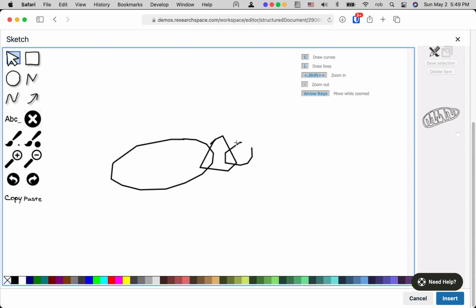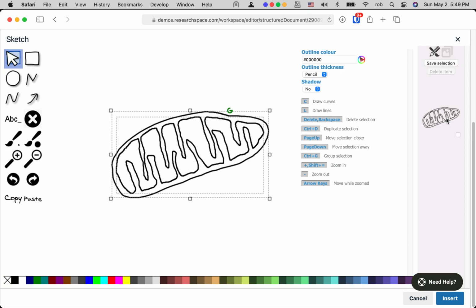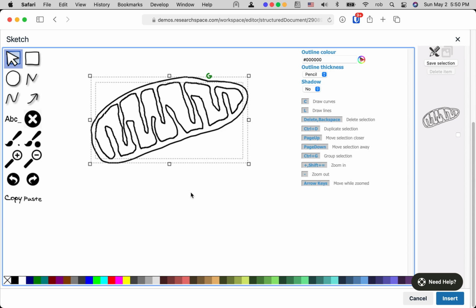But if I'm not particularly artistic, I can actually draw on existing material that already is available to me. So in this case, I'm not going to attempt to draw anything more complex. I'll just remove this. And instead, I'll add a drawing that I did earlier. And now if I want to, I can add any different content that I want, including additional annotations or changes to this diagram.